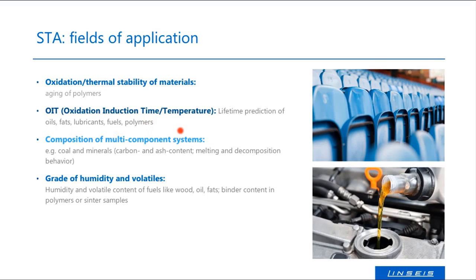You can see if there is a mass loss, and at what temperature there is a mass loss, and you can see how much oxidation takes place. Of course, only if you have oxygen in there. You can investigate the composition of a multi-component system by thermal decomposition.